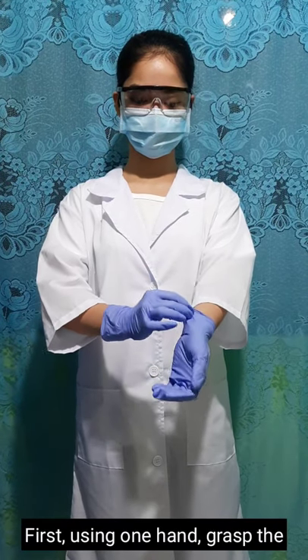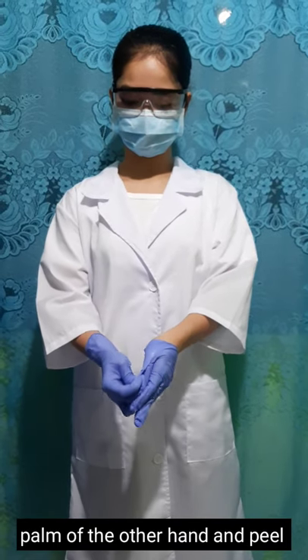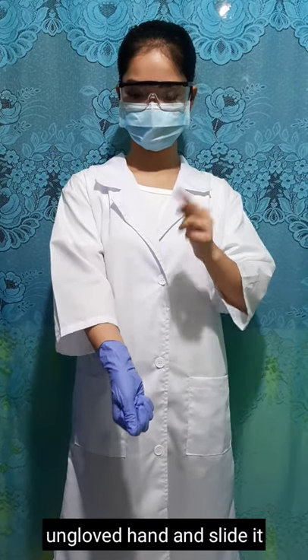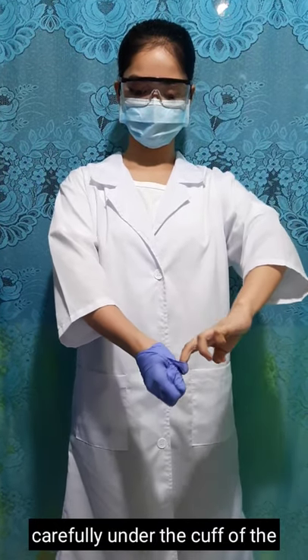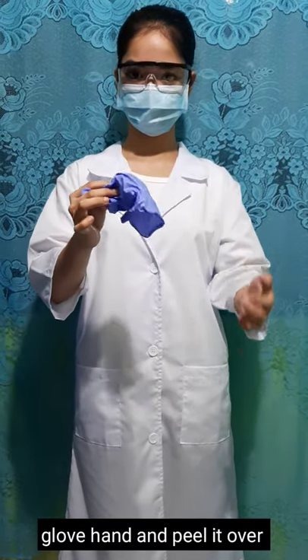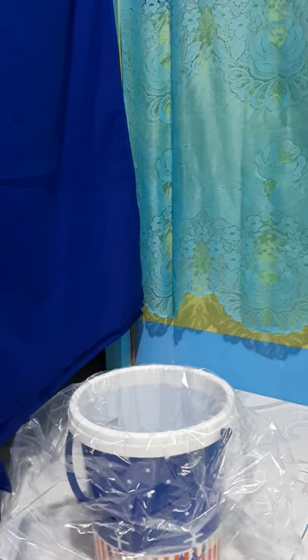First, using one hand, grasp the palm of the other hand and peel off the first glove. Then, take the index finger of the ungloved hand and slide it carefully under the cuff of the gloved hand, and peel it over and dispose of the glove.